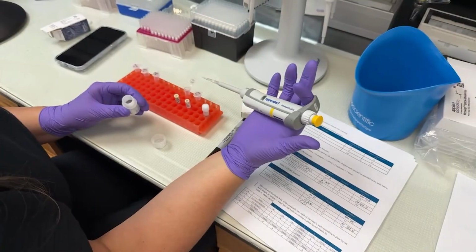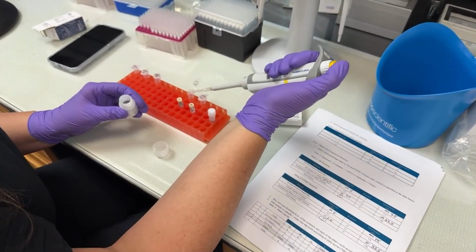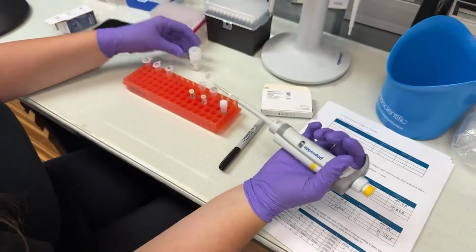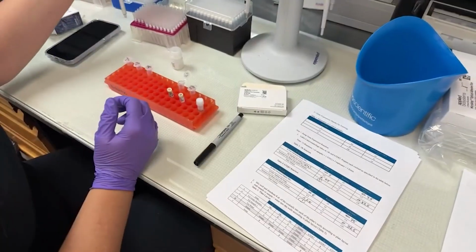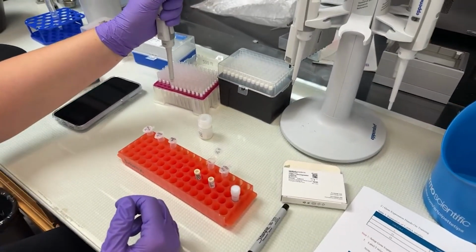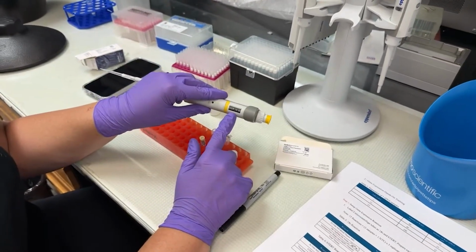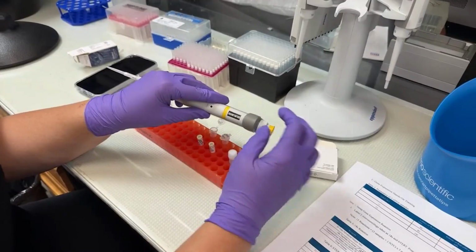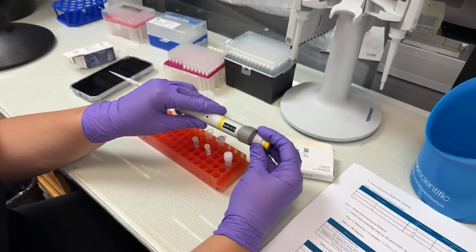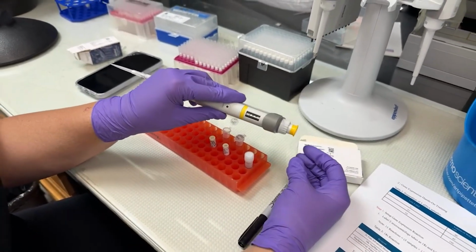So if you've ever used a pipette, just reminders: when you want to pick up sample, make sure that the tip is fully attached. Line it up and then give it a nice solid push. You want to make sure it's dialed up for the appropriate volumes. This one can be changed. There's a bunch of different models, but you can dial in exactly what you want. So make sure that is correct.